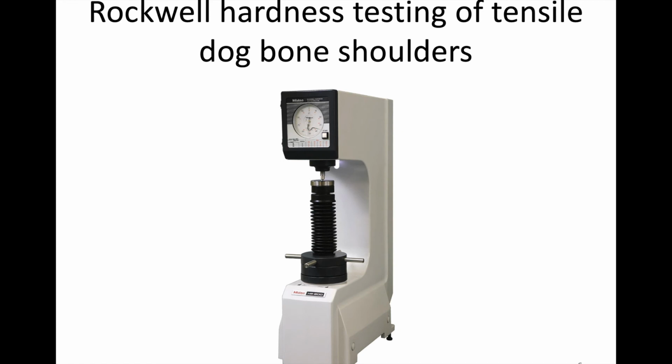All right, hardness testing, I don't go over much of that, just because I think everybody's done that before. But basically, Rockwell hardness testing, and we do that on the tensile dog bone shoulders that have been cleaned off of any possible oxide.